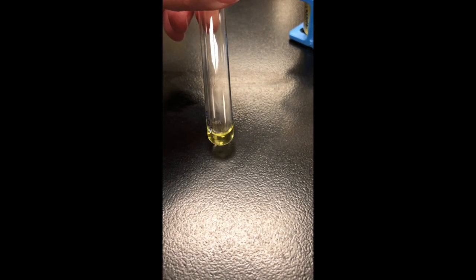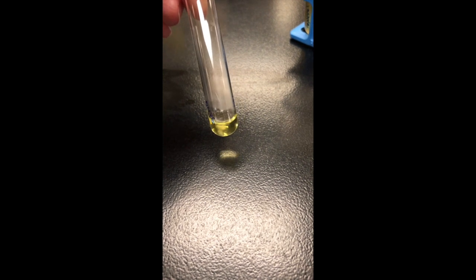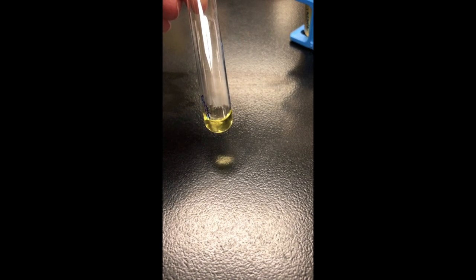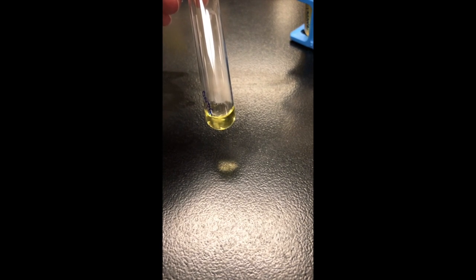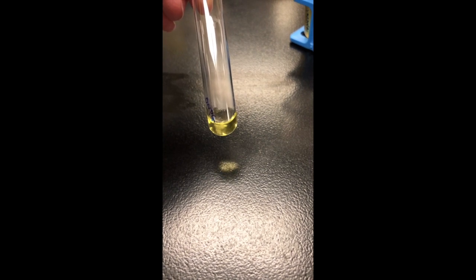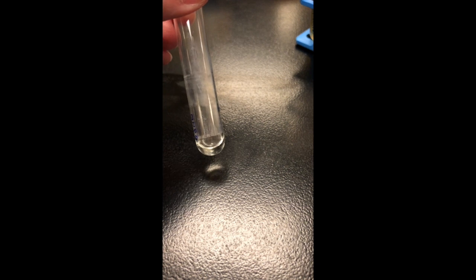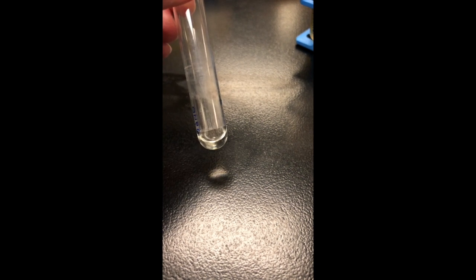Our next test is the ONPG test. Remember, this shows us if we have beta-galactosidase. These started clear. Now, our Enterobacter is no longer clear. That's a nice bright yellow. And so this organism can break down the lactose analog, showing that beta-galactosidase is present. Here's your unknown. What do you think? You tell me, is that yellow or is that clear?